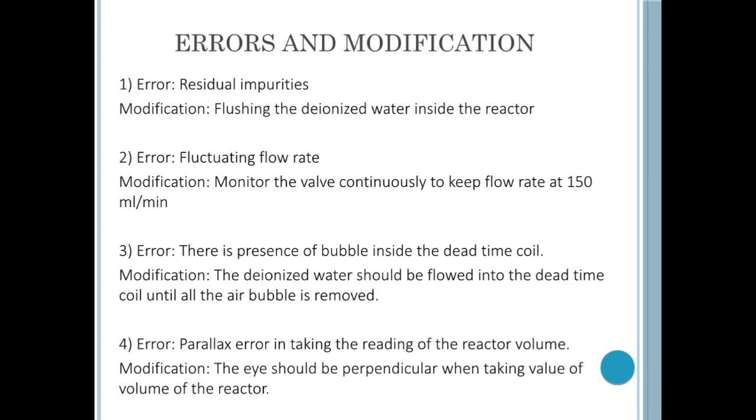There are some errors and modifications that might improve the overall results. The first error is the presence of residual impurities inside the reactor tank. The way to counter this is by flushing the deionized water inside the reactor to remove the impurities. The second error is the fluctuation of flow rate and we can improve this by monitoring the pump continuously to keep the flow rate at 150 ml per minute. The next error is the presence of bubbles inside the dead time coil. Before starting the experiment, the deionized water should be flowed into the dead time coil until all the air bubbles are removed.